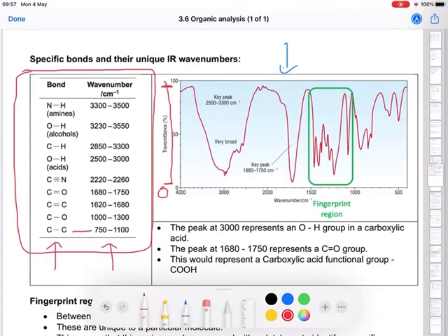So what we get is this red squiggle that we've got all the way along here. We call things like this, I'll just put a star in it in blue, we call this a peak, even though it actually looks more like a trough. But it's a peak because this is the absorption of infrared radiation that is being absorbed by a specific bond. And if you look at where it is, we've got it between 2,500 and 3,300, which means it's possibly going to be that one, okay?